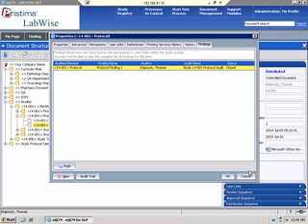So if you're doing an audit on an SOP, and your SOPs are managed in the system, you'll see all of the audit findings on your SOPs. So you can look at, as management, does this SOP need to be updated? Do the staff need to be retrained on it? So any findings are all automatically linked to the element that you're auditing when managing it all within the system. And that's the benefit that Labwise brings to your business, because not only do you get audit functionality, you get study registry, study data, reporting, protocols, all of that document management and workflows, but you also get the linkages between.